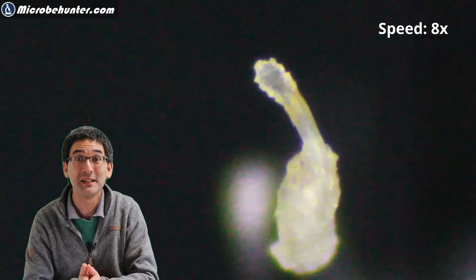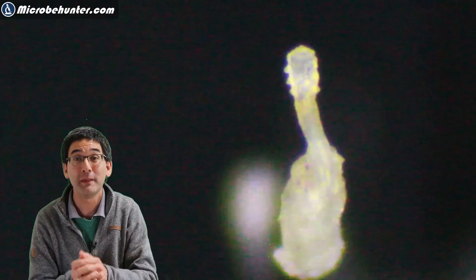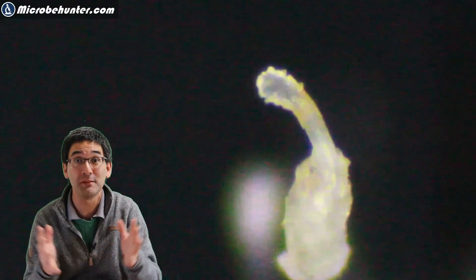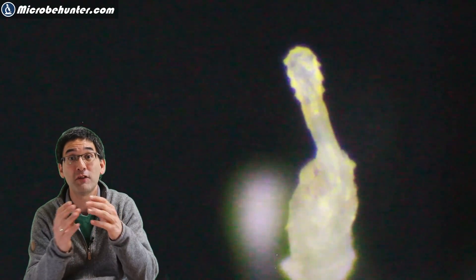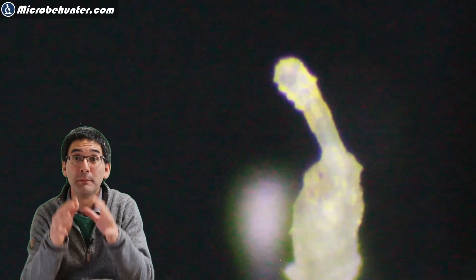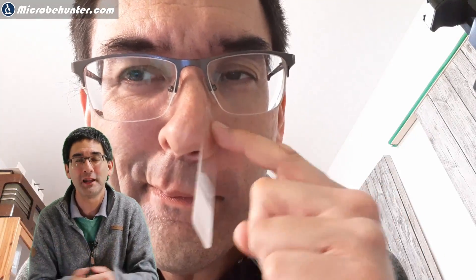I found one — unfortunately only one. Here it is, a little bit in time lapse, moving around and wiggling around. If you look carefully you can also see the eight legs, because as I mentioned they are related to the spiders. They have a very large and long abdomen — long and slender. The bottom part is still part of the hair follicle, so they live there and they eat the oil that the hair follicle makes.